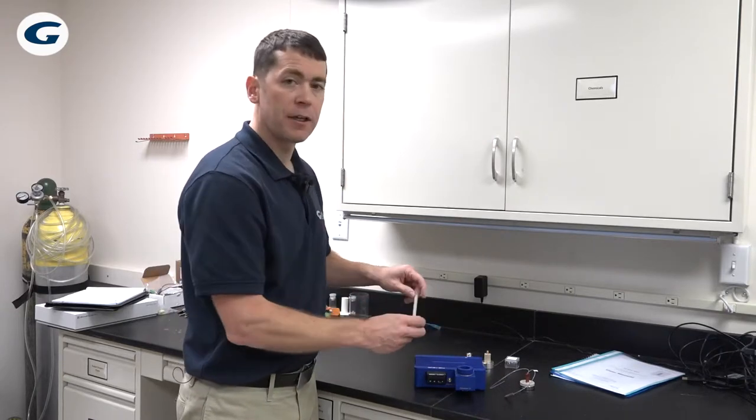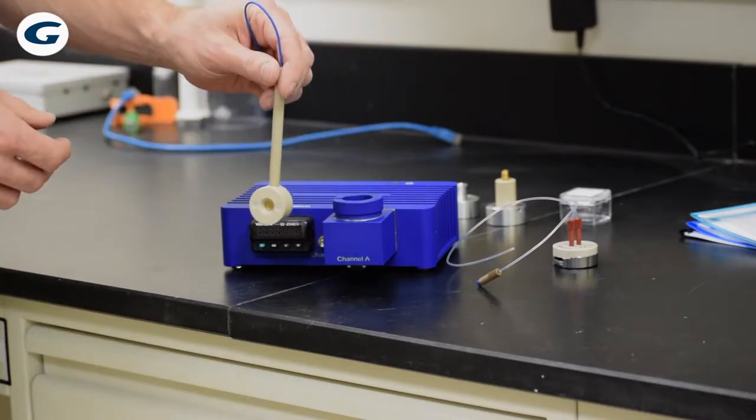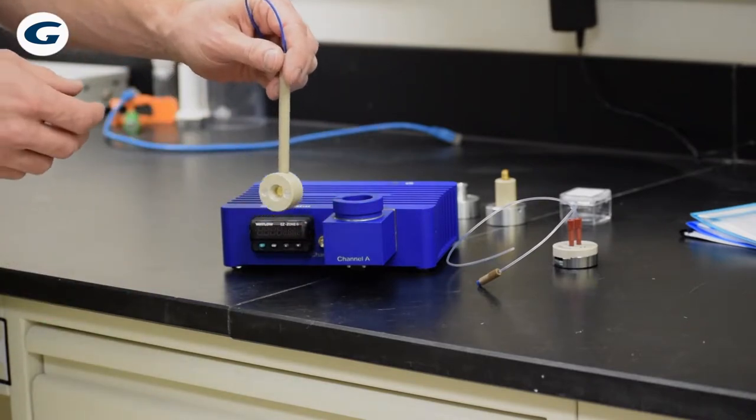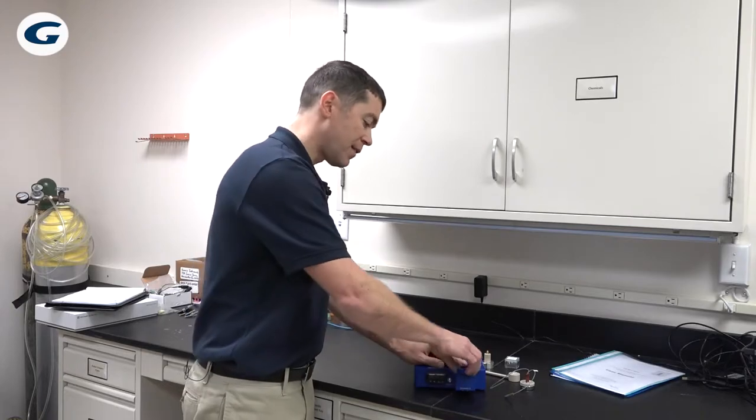So you have an accessory, this dip-in holder that you would connect to there, and then you could do non-temperature controlled QCM studies. If you're going to do temperature controlled QCM studies, there's a flow cell module that you have.